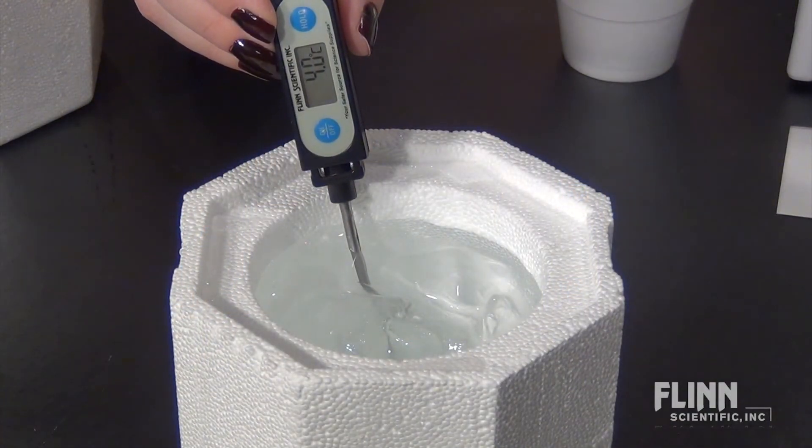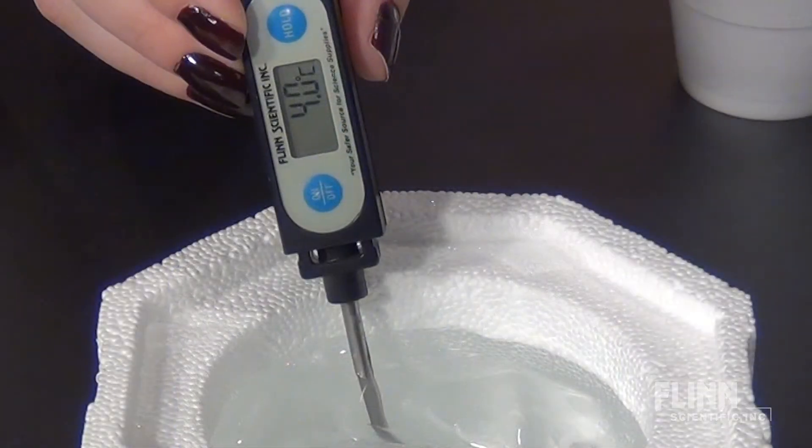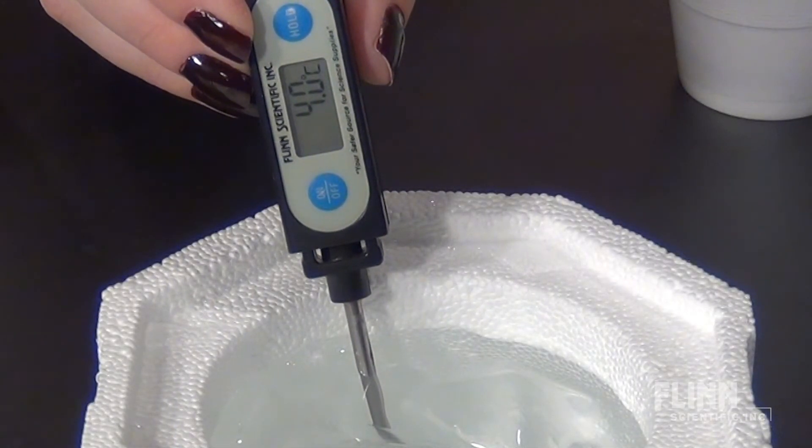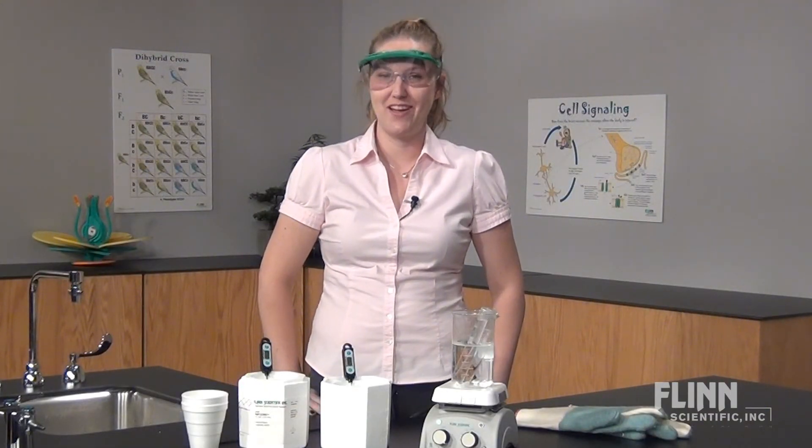Ice baths are common for enzyme experiments. Insulated cups or safe cubes are great to keep the ice water frigid for an entire class period. Please let us know if you have any questions about water baths or anything else in your biology lab.